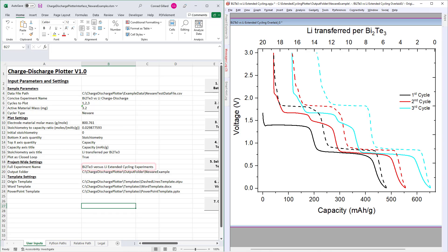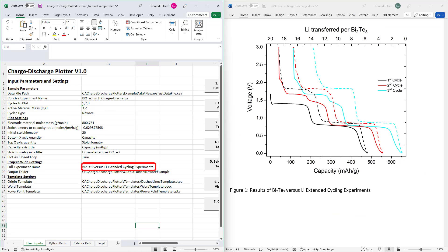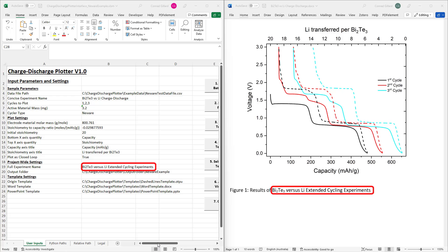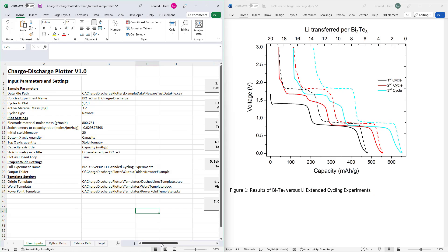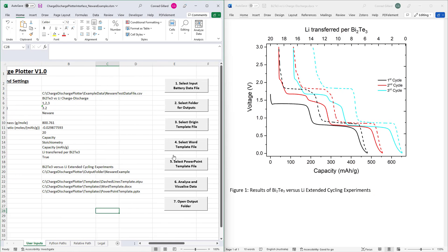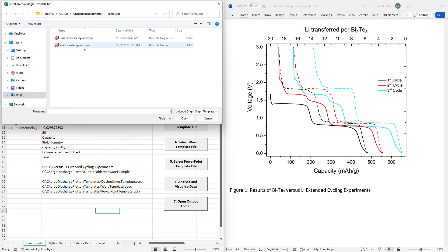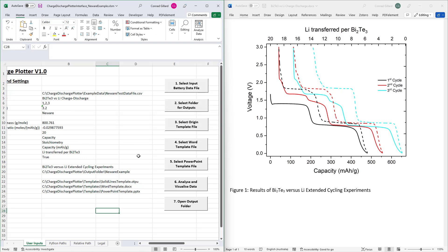Next, specify the full experiment name. This will be used to generate the caption that will appear in the output Word document. Next, specify the Origin template that you wish to use. This affects various properties of the generated graph, such as whether the lines are dashed or solid.